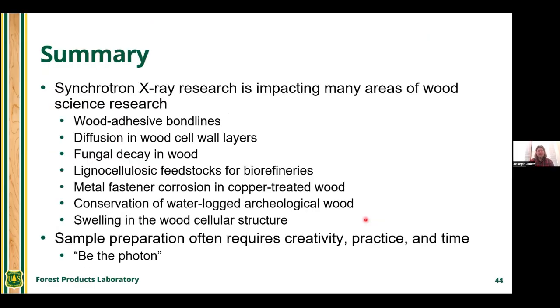So coming to a summary, synchrotron X-ray research is impacting many areas of wood science research. From wood-adhesive bondlines to diffusion in wood cell wall layers, fungal decay, lignocellulosic feedstocks for biorefineries, metal fastener corrosion, conservation of waterlogged archaeological wood, swelling in wood cellular structure. And I think there's other opportunities as well. And I think as I showed, sample preparation often requires some creativity, practice, and time.